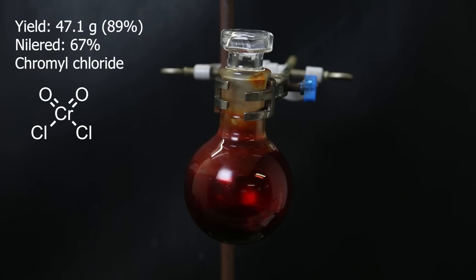The yield of the chromyl chloride turned out to be 47.1 grams, or 89%, which is higher than the yield NileRed got in his video. I assign the difference mostly to the improved mixing with the stir bar.